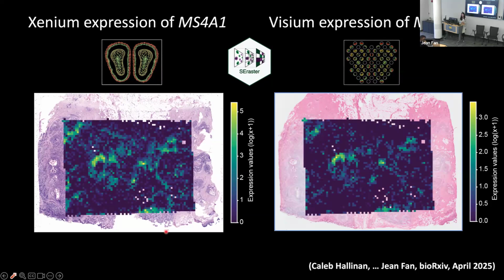Yes? Using the rasterize tool, can you define the resolution that you're rasterizing to? Great question. This is 200 microns. Within the software, it's possible. Yes, that is a hyperparameter that we can pass into the tool. It's actually a very interesting area of exploration to characterize different spatial patterns at different scales. So we are using that tool to see what happens at a 50 micron resolution versus 200 versus 400, and so forth.